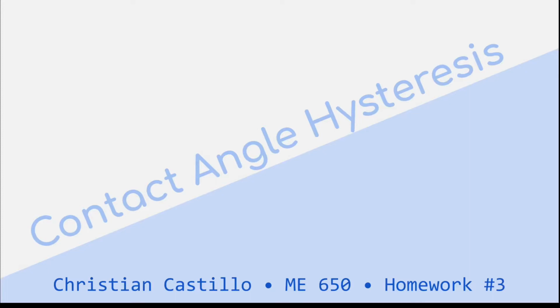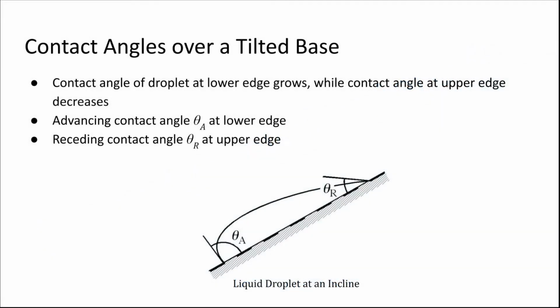Hello, so today I'll be demonstrating contact angle hysteresis over a tilted surface. When a surface is tilted at an angle, the contact angles of a droplet on the surface change due to a shift in the interline forces in the droplet.